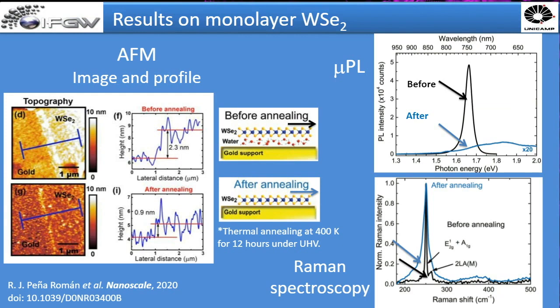I sputtered polycrystalline gold, so it doesn't have sufficiently long-range order to impose a pattern on the TMD on top and to present this moire pattern. But of course, it would be possible to see this pattern if the substrate had the same kind of ordering as the layer on top.